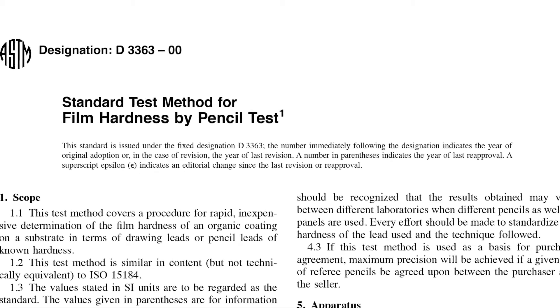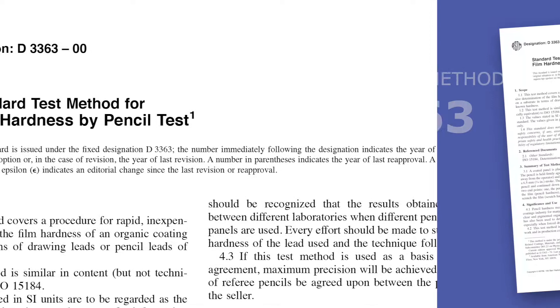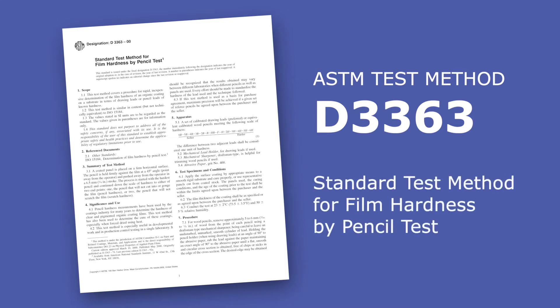This video demonstrates how to determine the pencil hardness of an organic coating using wood or mechanical pencils in accordance with ASTM test method D3363, standard test method for film hardness by pencil test.